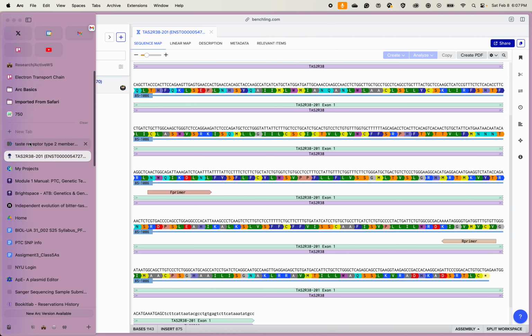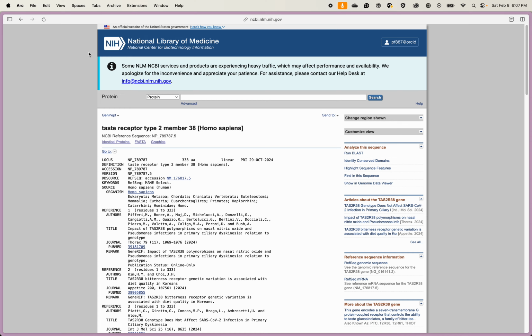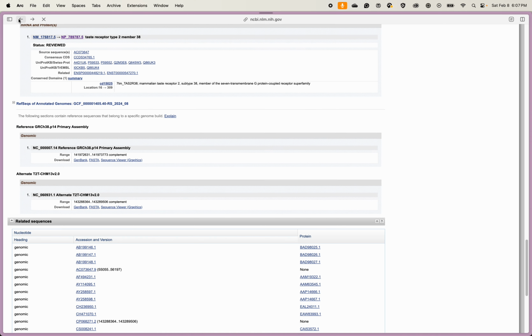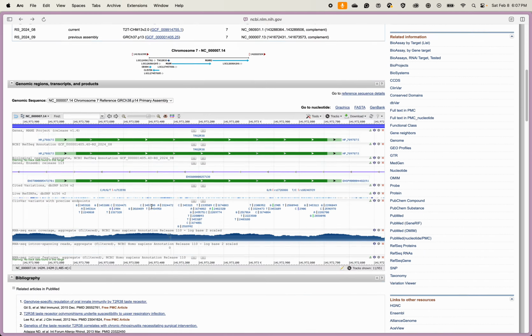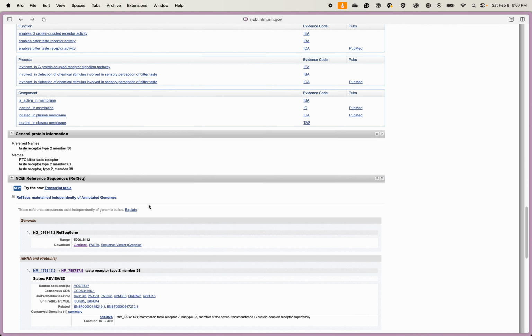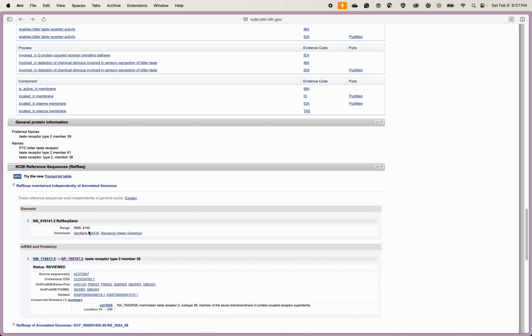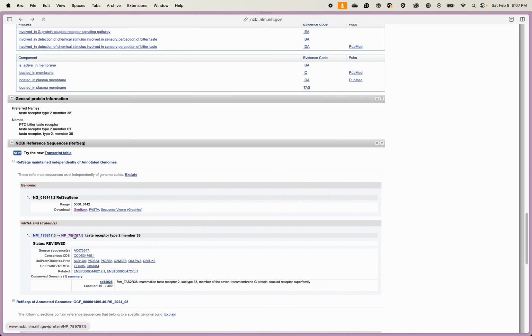How is that? Well, if you remember the last video, we have this website. Again, we just go back. So if you search for the gene, you get to the gene page, you go down to the RefSeq information. There's the genomic. Remember, we got the GenBank file for APE. Now, next, we can get protein information, right? We can click here.